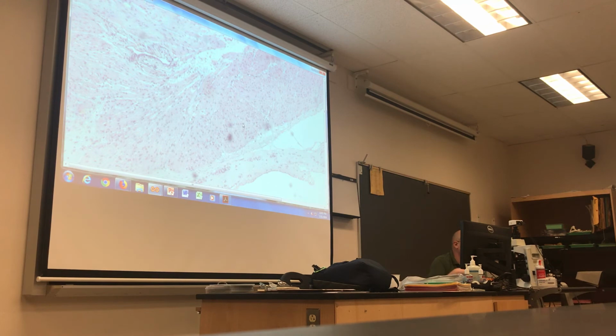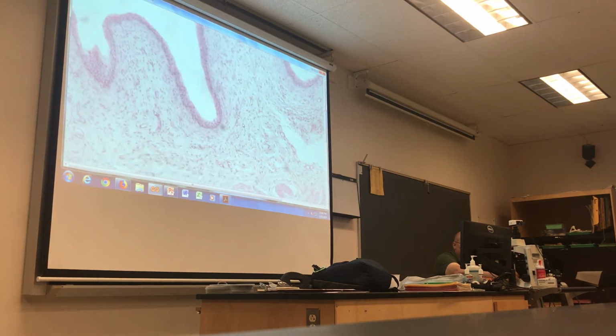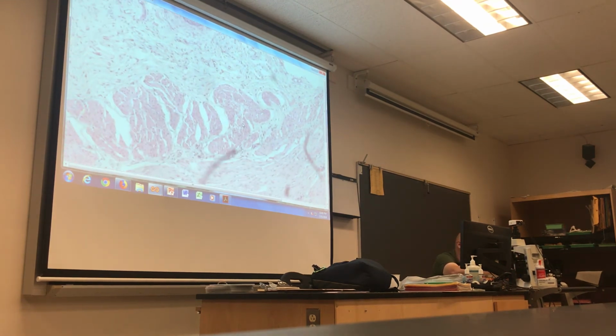That's as far as I can zoom out. You can see the whole detrusor muscle when you're zoomed out on yours. My camera, like I said, has magnification issues, but you get the hint, right? You know what smooth muscle looks like at this point, hopefully. If not, quit. So, you should have an idea of that, right? So the smooth muscle on the bladder slide, the detrusor muscle, right? So any questions about the bladder?